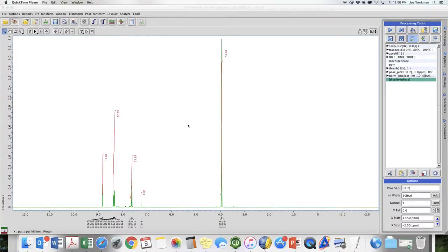Show you how to manipulate an NMR spectrum using the Delta software. This is something that you would want to do if you needed to, for instance, change the integration, find a better way to display some of the signals, and perhaps to annotate the spectrum.